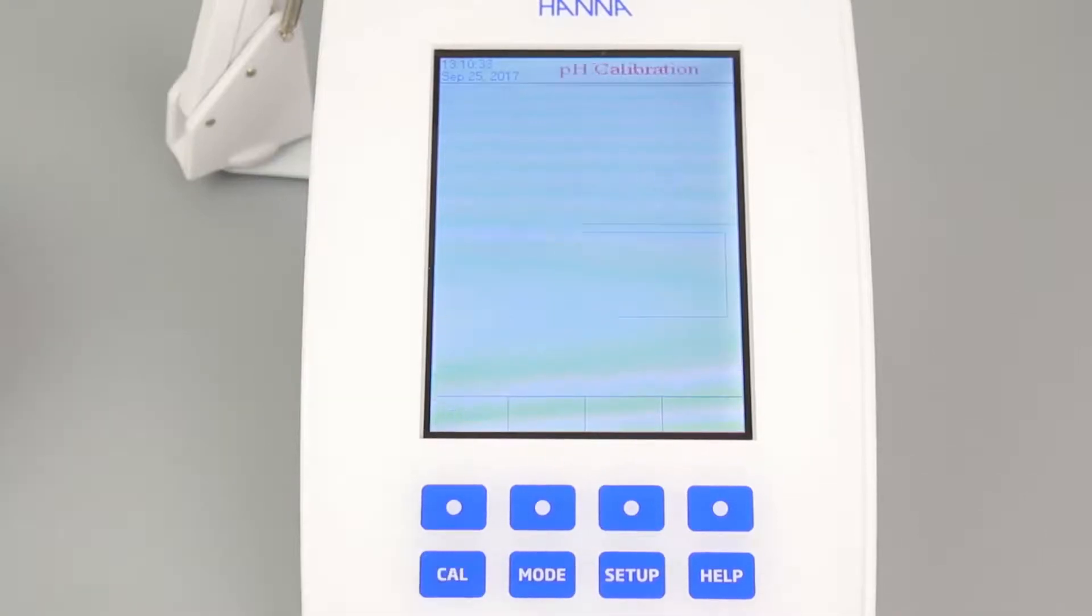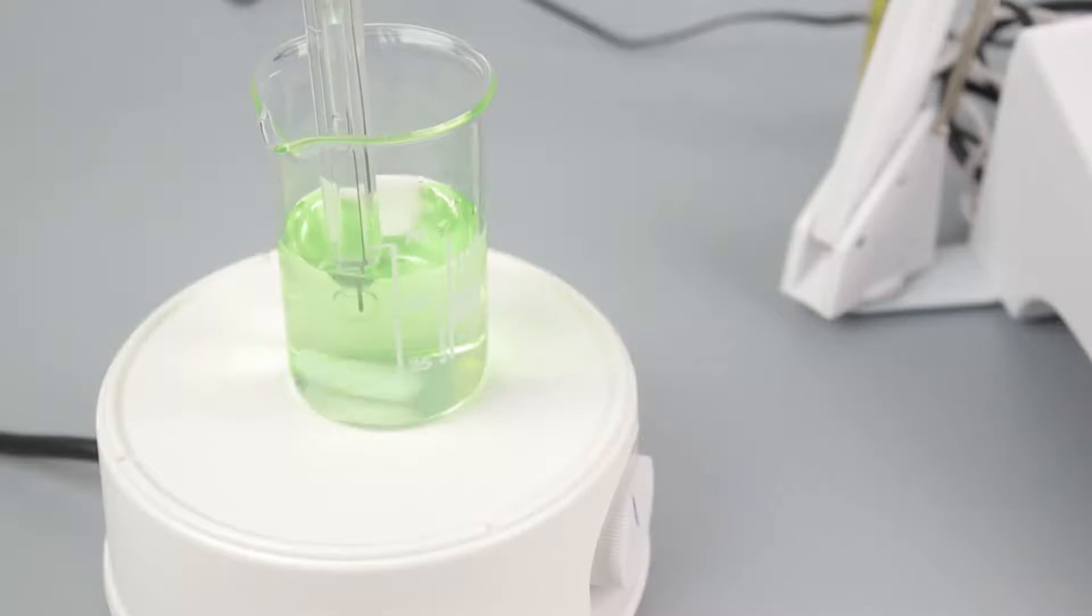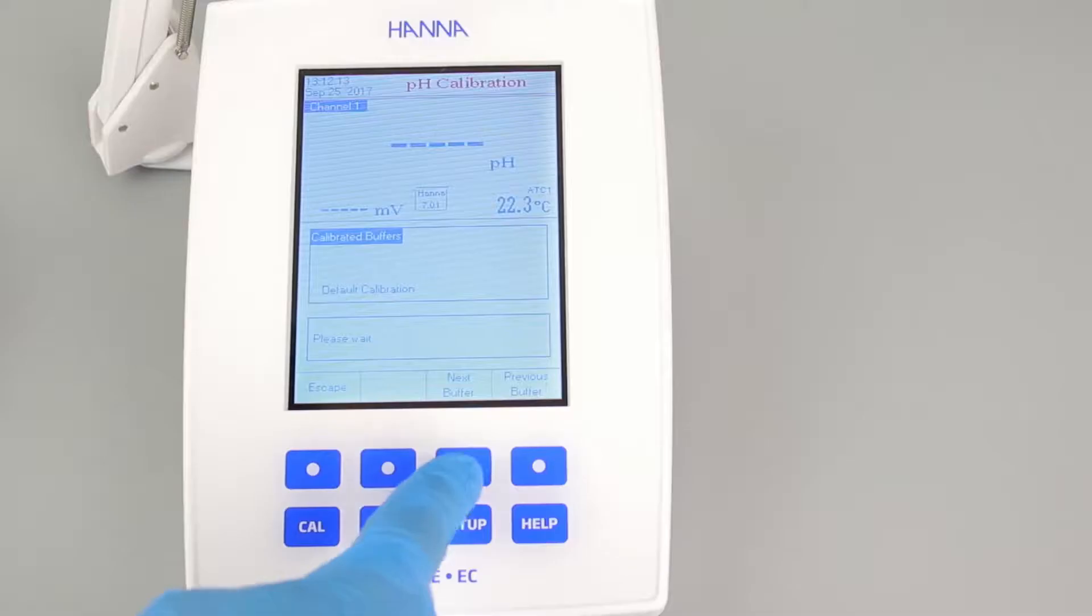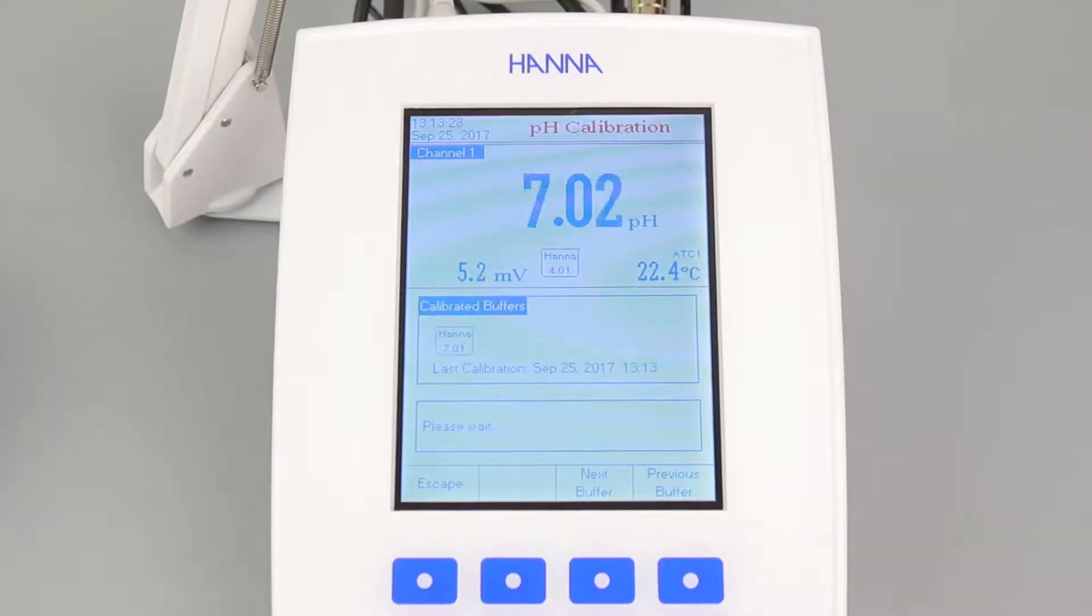To calibrate your meter, press the CAL button. Then place the pH electrode into your buffer. Make sure the sample is stirring. Use the next buffer and previous buffer buttons to match the value you're using. Once stable, press accept and the calibration will be saved.